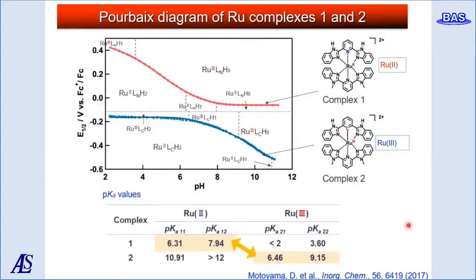Here are shown two ruthenium complexes, complex 1 and complex 2. Both complexes are quite similar; the only difference is that ruthenium complex 2 contains a ruthenium cyclometallic bond. As shown here, only the nitrogen atom of complex 1 is replaced by a carbon atom.